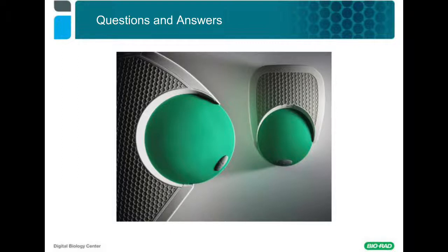We don't have any feedback from sanitation systems, really, but I cannot see a reason why it would not be. This is definitely something that many different teams in pathogen detection, pathogen safety labs have been exploring. So I believe that in the coming years we will see a lot more of the digital PCR uses in water sanitation plants and other types of facilities as such.